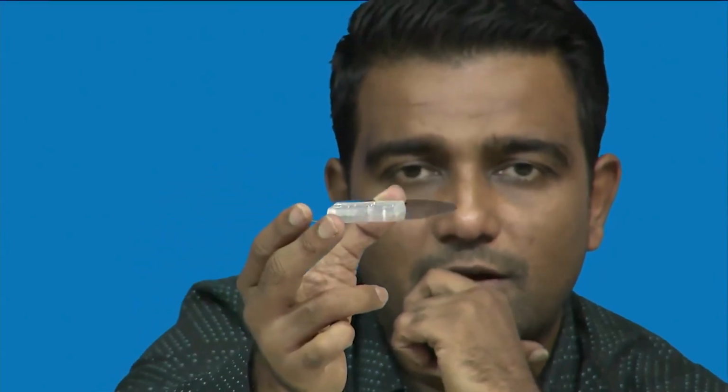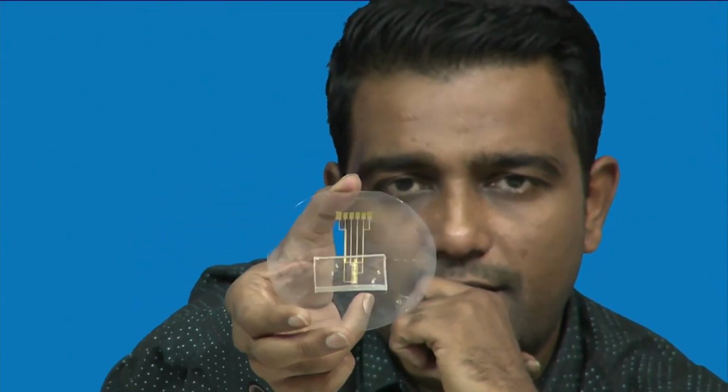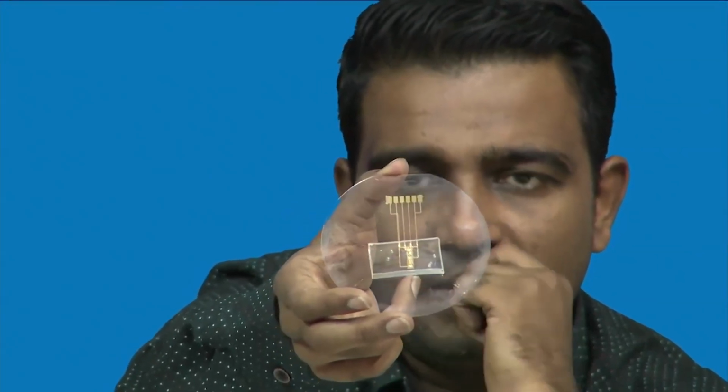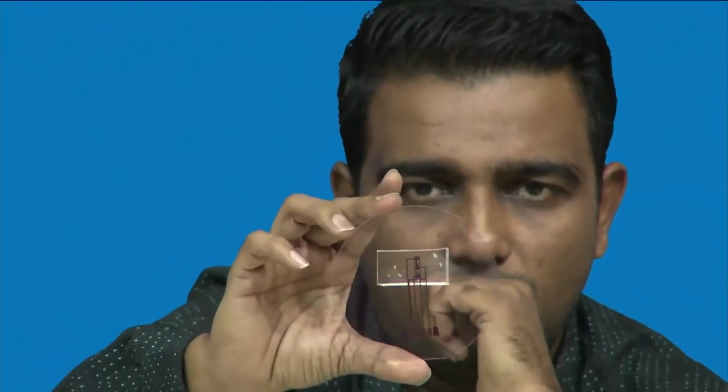I can show you in this particular format because I want to show you the PDMS layer. Then you can see a channel, interdigital electrodes, and there is a heater. Everything is on the front side, because we can have an insulating material on the heater.